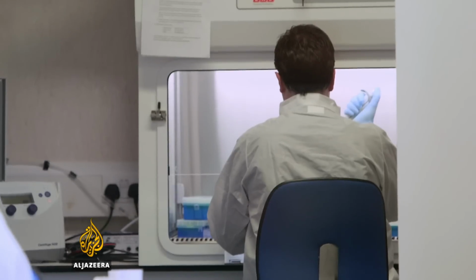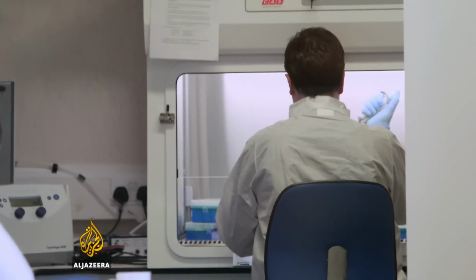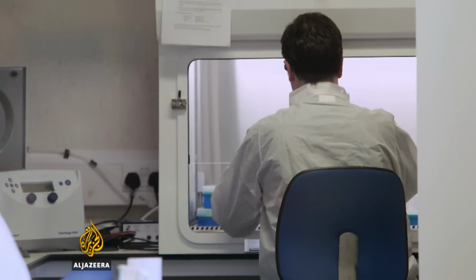What we really want to be doing is to see whether you've got drugs that can actually cure things like hepatitis B. So how does that work in here? How can you look for that kind of thing? We put the virus with the liver cells in the plates that we saw downstairs. The virus then will replicate within the cells, and we can measure how drugs affect the virus.